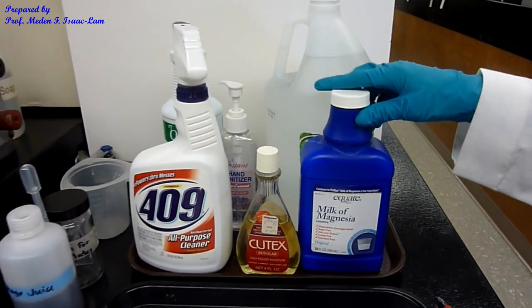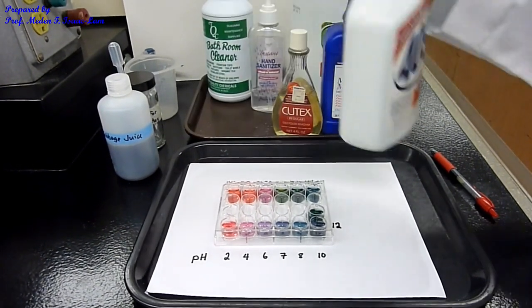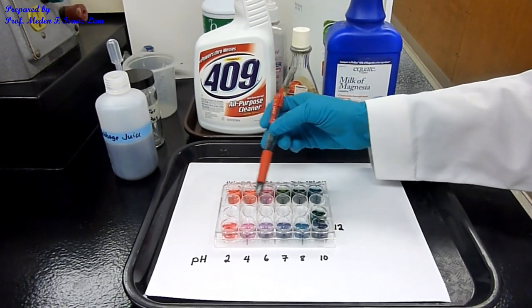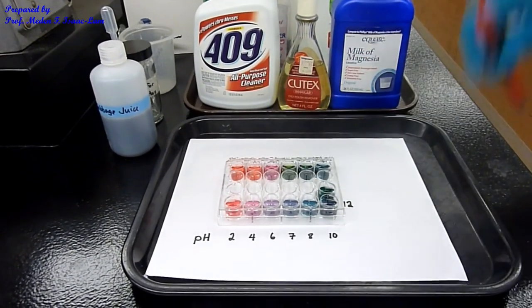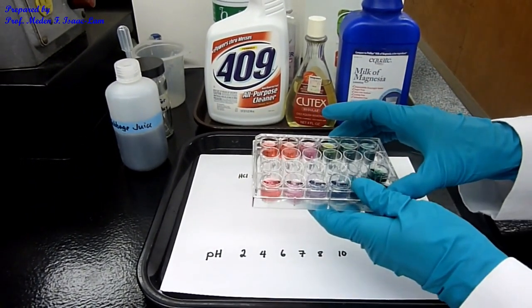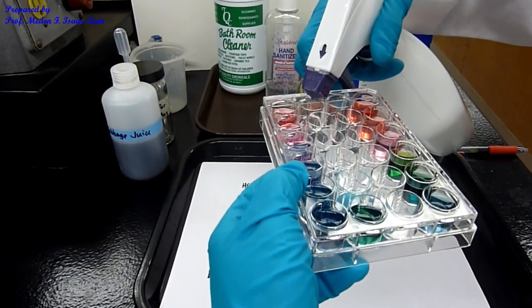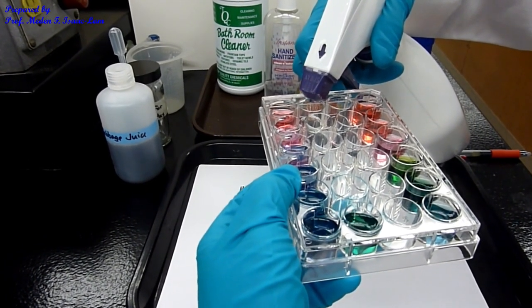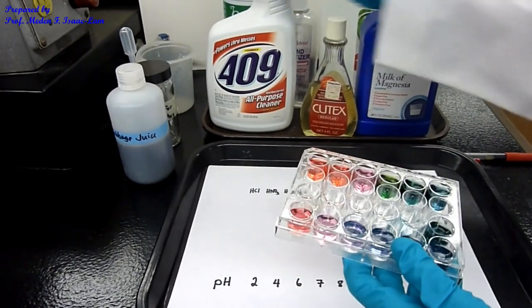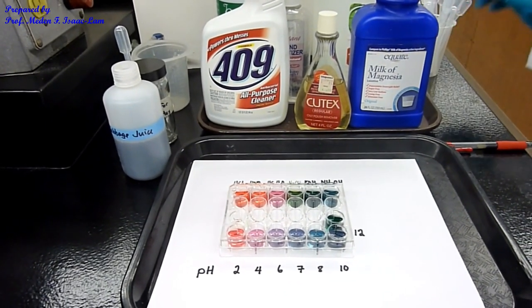So we have six solutions. I'm going to put in each well approximately 20 drops. For instance, for this one, I'm just going to do in this well, 1, 2, 3 in front, and the back is 1, 2, 3. So we're going to use this well. I'm just going to be careful that I don't contaminate the other wells. I'm going to approximately squirt, and then I'm going to use the dropper. I have the dropper here for the Cutex.